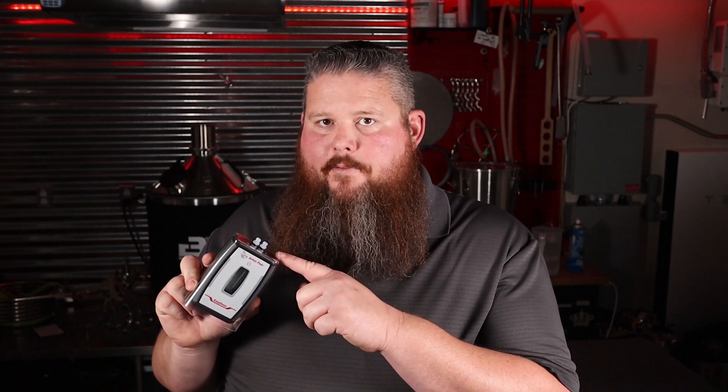Basically you can use this hot side, cold side, wherever you want in the process. You can put hot wort through it, cold wort, you can put finished beer, halfway finished beer, all the beer through it. Right now I'm going to show you how to use it.